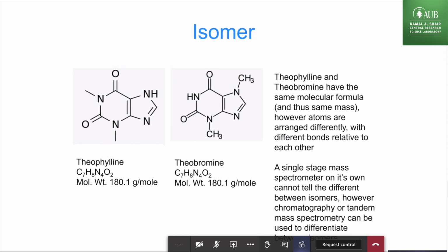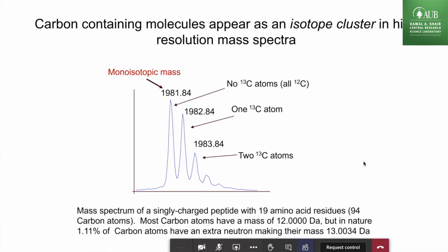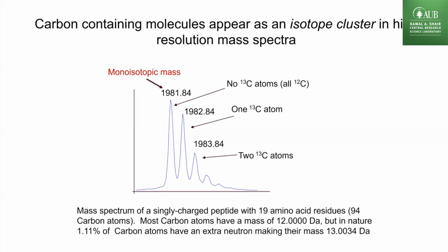So here I chose two compounds which perhaps we all enjoy at some point. I think everyone understands mass, right? That's pretty easy. But the isotopes are maybe new to a lot of people, and this information is so rich. Look at this. From this compound, we have 5 peaks to look at, right? So we can use that information in the data analysis.